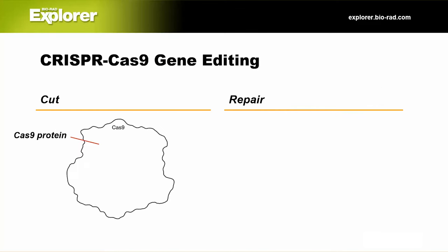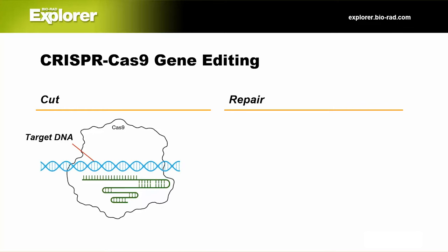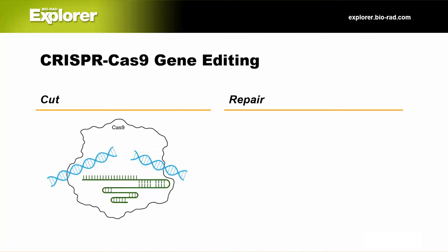Okay, time for a quick refresher. We often focus on how CRISPR technology is used to cut DNA, but CRISPR gene editing involves two broad steps, cut and repair. First, Cas9 and the guide RNA form a complex. Together, they find the target DNA based on the guiding nucleotide sequence of the RNA. The DNA unwinds, and the complementary sequence binds to the guide RNA. Then Cas9 makes a double-stranded break, cutting the DNA.